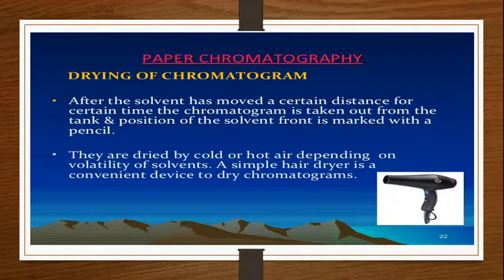Now what we have done, we have developed the chromatogram, what they have called a development process. There are different ways of development with respect to the dimensional characteristics, because paper is a flexible one. You can convert it into any dimension, any format, any shape, and that provides flexibility. Hence there are different techniques of development, maybe ascending, descending, ascending-descending hybridization, circular, or two dimensional. We have already dealt with it, and after development you have to dry the chromatogram. Up till now we have completed up to this.